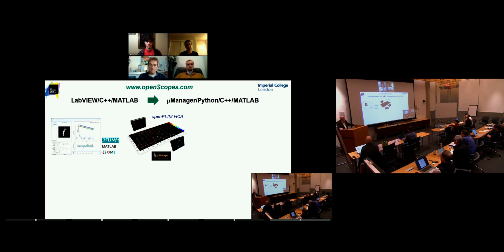We've also been asked to work on single molecule microscopy, so we're building a high throughput STORM platform. And having done two high throughput platforms, Sunil Kumar at the back is developing a generic, if you like, Micro-Manager-based high content analysis platform, acquiring images, moving XY stages for multi-well plates, etc. And since then, we've also been particularly working on trying to develop open hardware.